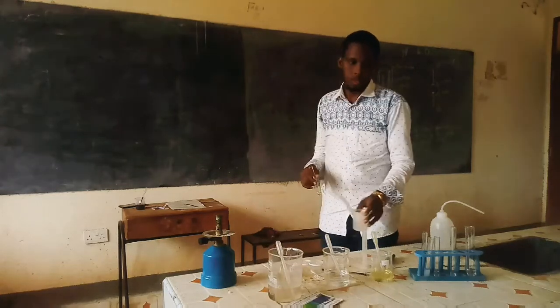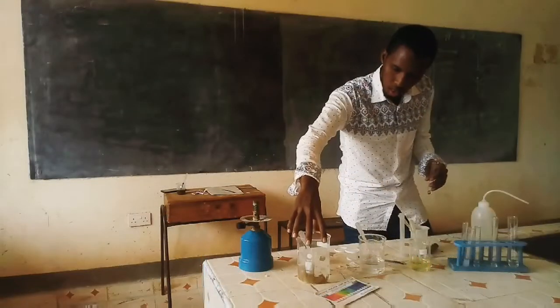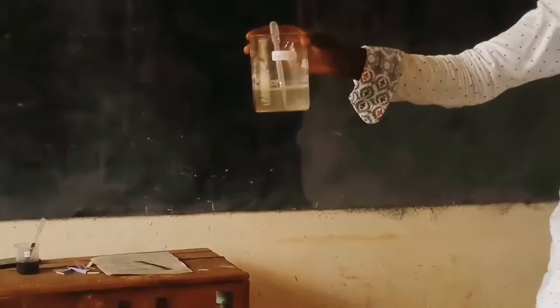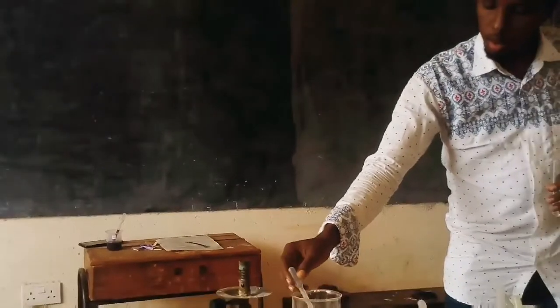Now to the third portion we add barium nitrate. Note barium nitrate tests anions. So let us make the observation.